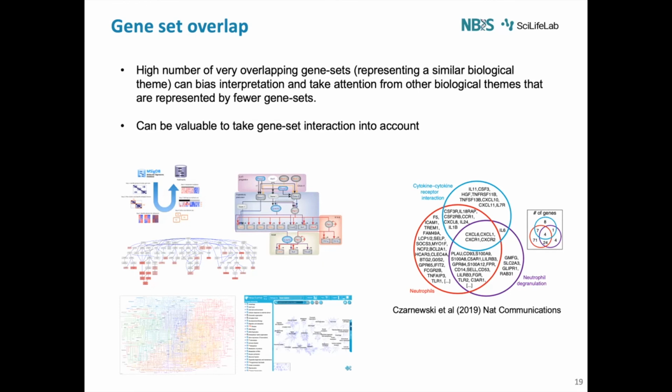But actually, there are still other terms below in that list that might be related to something else, but their p-values will not be that significant. But that could still be a biological result for you. So always take care to also look down in the list and check for other patterns that you see. Maybe you see antigen presentation, regulation of MHC, or pathways that are all very similar as well.